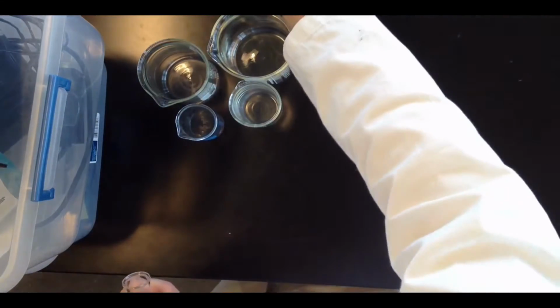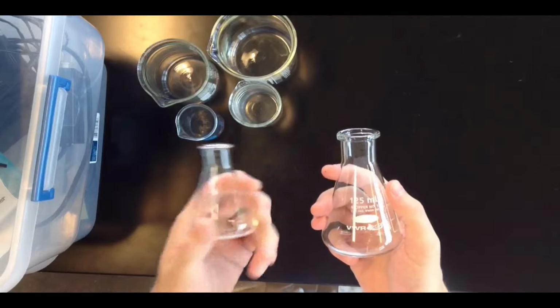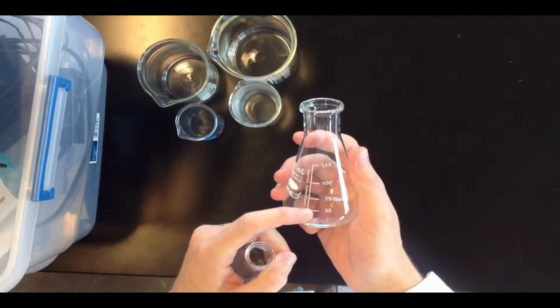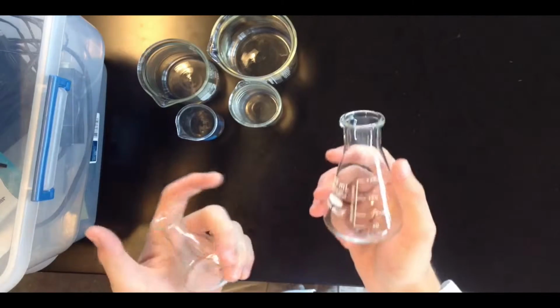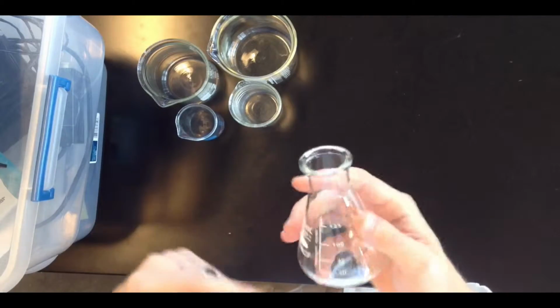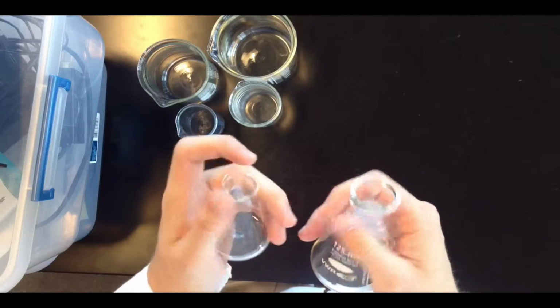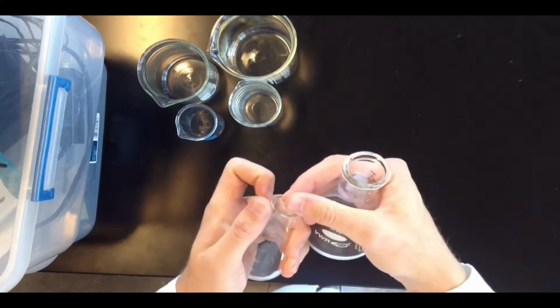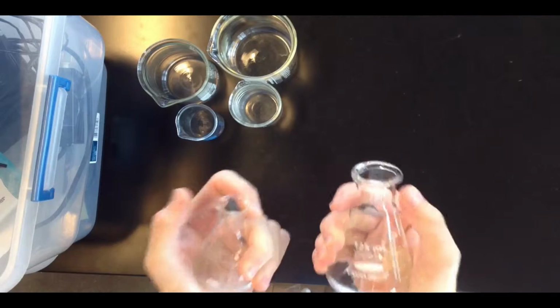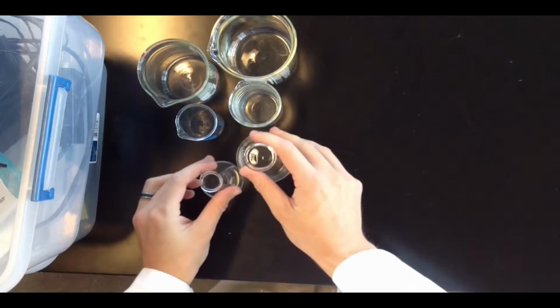Now, similar to the beaker in function, but a little different in shape, are the Erlenmeyer flasks. So here we have a 50 milliliter and a 125 milliliter Erlenmeyer flask. And like the beakers, these have volumetric markings, but again, these are ballparks. So you can use them to approximate a volume, but they should not be used to measure or deliver liquids, just to store them. The Erlenmeyers have a thinner opening, which makes them a little bit better in some cases for running reactions, and we'll again use these regularly for things like titrations and running reactions in the laboratory.